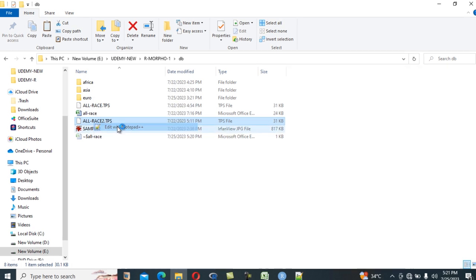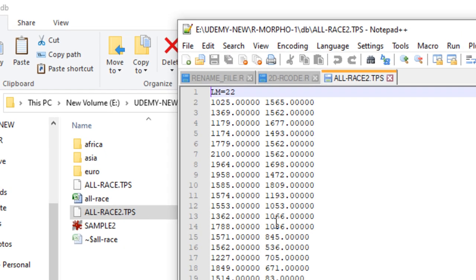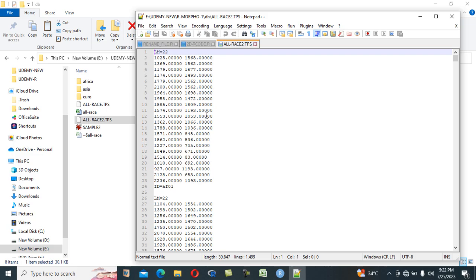Digitize twice. What it means is that you have to have a repeat. Under normal research conditions, you must have at least three repeats for proper analysis if you want to do your measurement error data. I have two repeats here, just as an example: the first digitization and the second one. We are going to use them later for our analysis. So you can keep the file, and you have to do your own like that as well. You do the first set, digitize, and the second set as well.